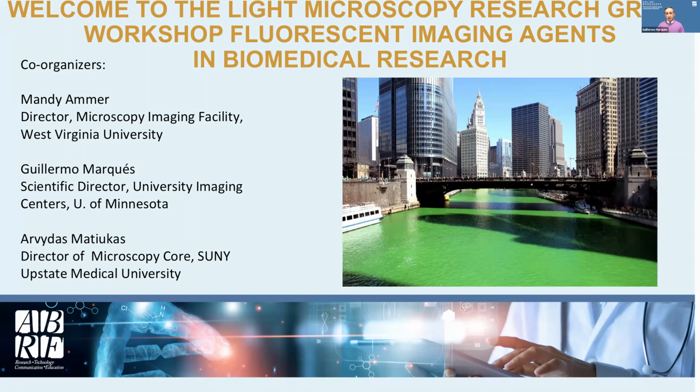However, that doesn't mean that you should always stick to fluorescein, typically referred to as FITC, for your imaging needs. I will argue that the recent developments in the generation and characterization of fluorescent molecules make it imperative that you do your homework, and instead of getting a secondary that's been sitting 20 years in the laboratory freezer and using it just because it's there, you help yourself by going with something that is better.